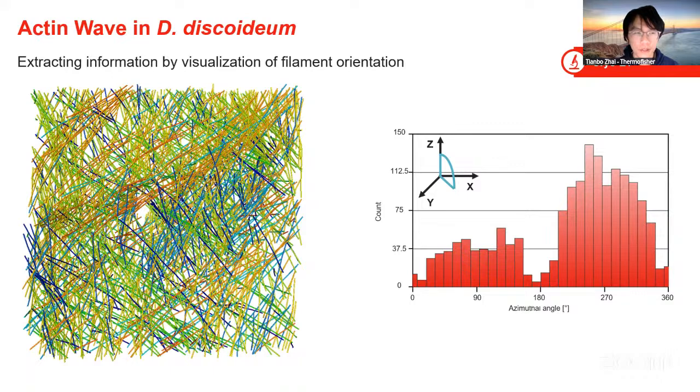In AMIRA, as far as I know, for the cylindrical template, you have two ways to input that template diameter. You can just type the numbers, or you can visually drag the cylinder template to match the structure of your light. So in that sense, I don't see a set limit that will prevent you.